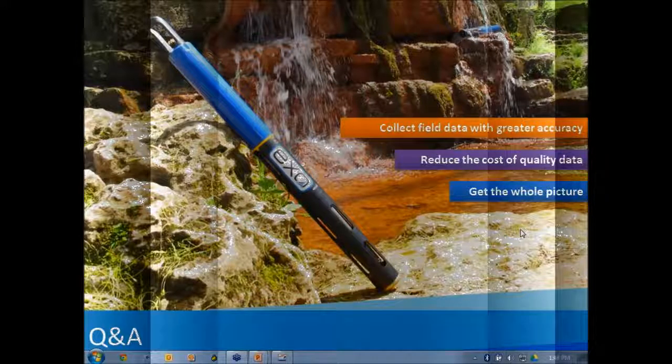And again, lots of questions about calibration. One was saying, hey, if I go and take samples at one of my reservoirs and do all the lab analysis, will that apply to my 3 or 4 other reservoirs? That's difficult to answer without some of this data, but what you do is you need to take a couple samples to validate that.